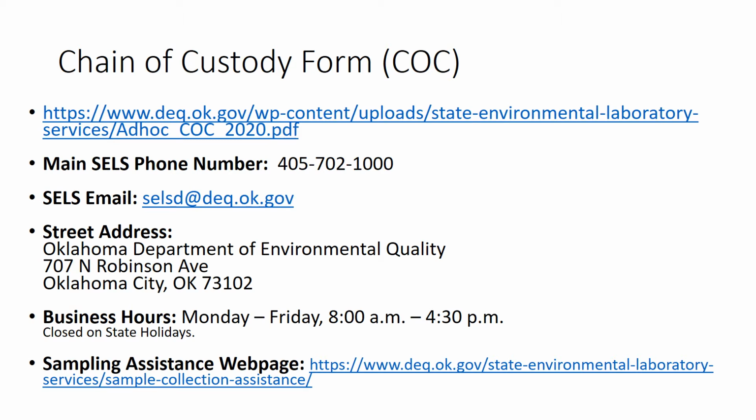We may need to have Water Quality Division update your sampler contact information, but we can also send you the paperwork directly until then. If you need to do some special non-compliance work, you can also use our ad hoc chain of custody for events such as test wells and line tests. You can get a blank ad hoc chain of custody on our website at the link in this slide, from our Sampling Assistance webpage for the laboratory, or pick one up from our sample management area located on the first floor of the DEQ building.